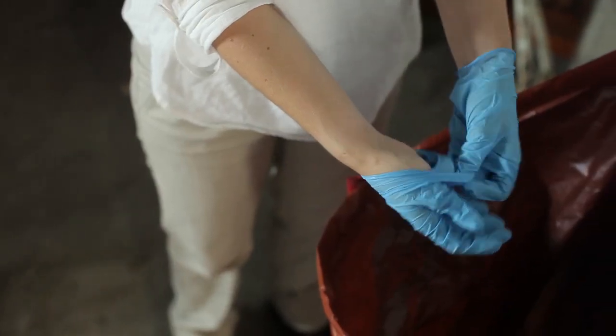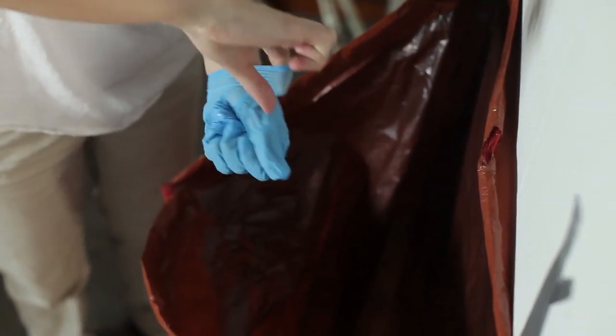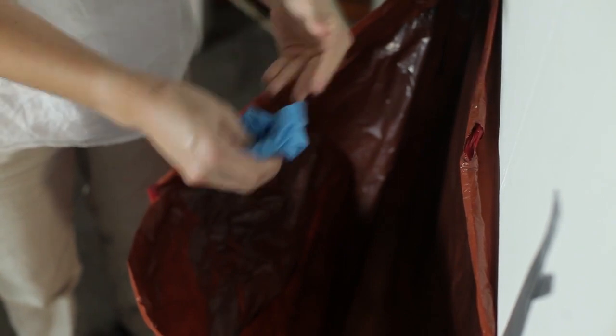When removing your gloves, grasp the palm of one glove near your wrist and carefully peel it off, turning it inside out. Do the same for the second glove and place both into the waste bag. Then, clean your hands with wet wipes and safely dispose of them into the bag.